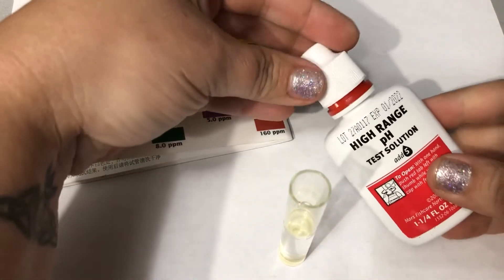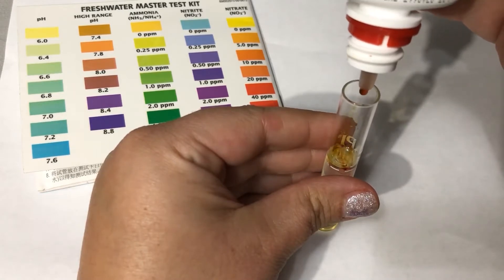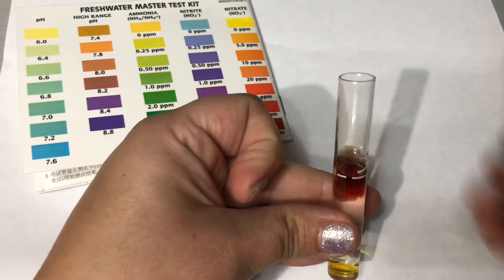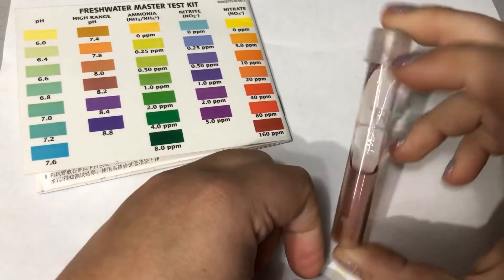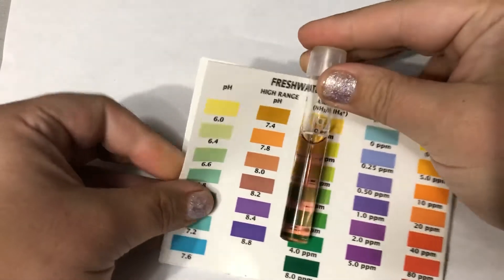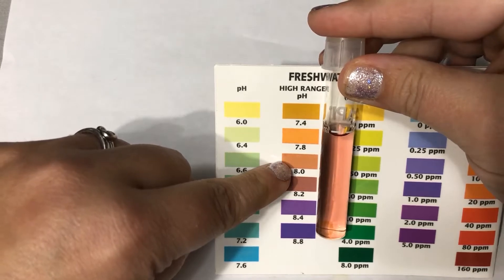I'm going to take off the lid and add five drops to my tube, holding the bottle straight up and down so that the drops are equal sized. You can see the solution is starting to change color. I put the cap on and invert it. You can see the color after inverting — it's an equal color throughout the vial. Comparing it to the test strip, mine reads at just about eight, so my pH is 8.0.